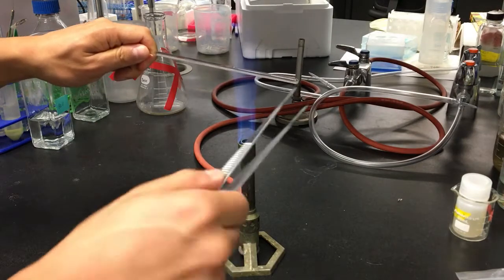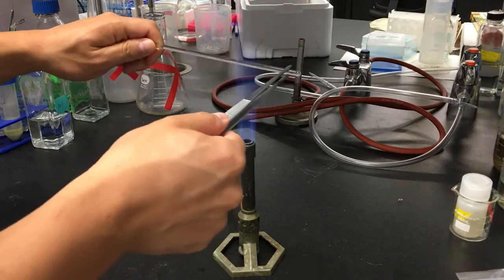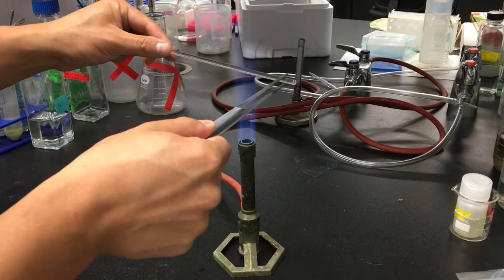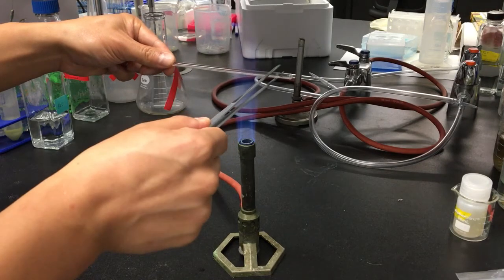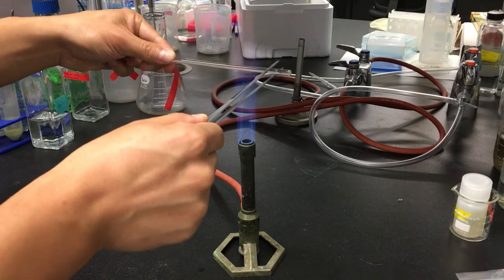First you'll need to soften part of the glass by heating it so that you can bend it. You will need a pretty strong flame to do this. Hold the rod furthest from the part you're heating.